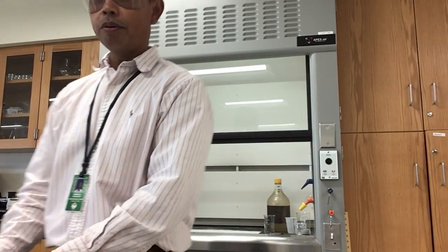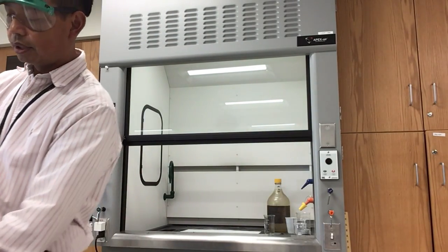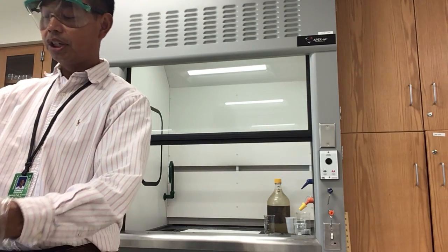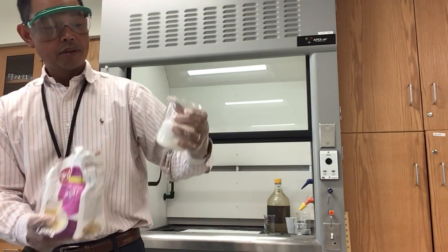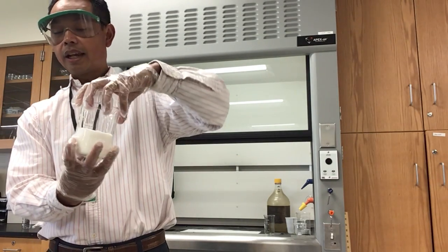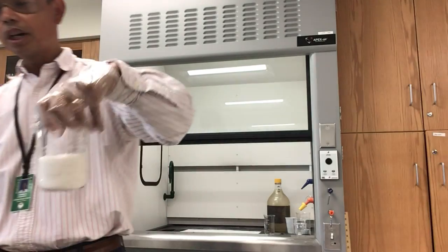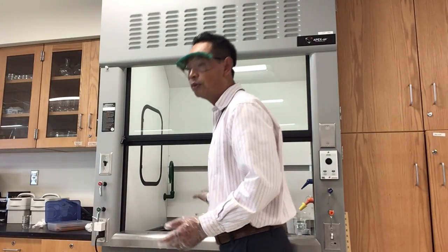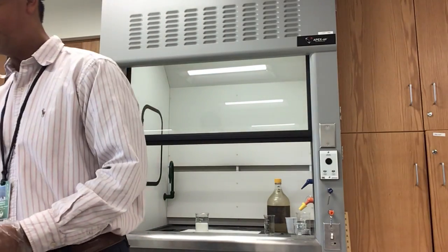So with this demo, I'm going to call it Sugar Rush, because some of my students call it Sugar Rush. So this is just plain sugar from Big Y, right? But again, in lab, we don't eat or drink anything, so we're not going to eat this. So it's just plain sugar, right? I'm going to do it in the fume hood because the air is kind of toxic, right?